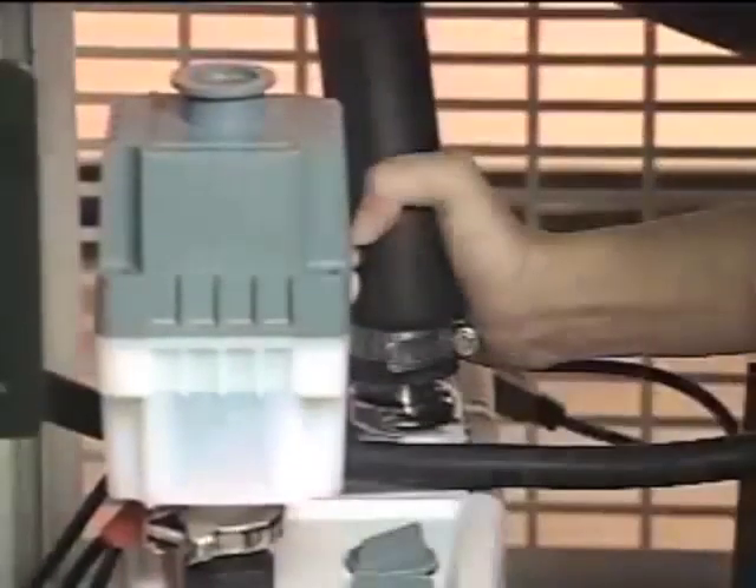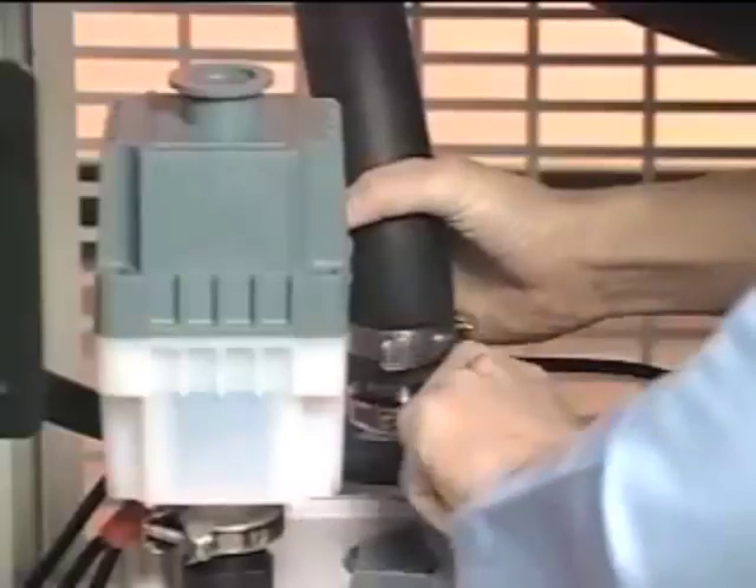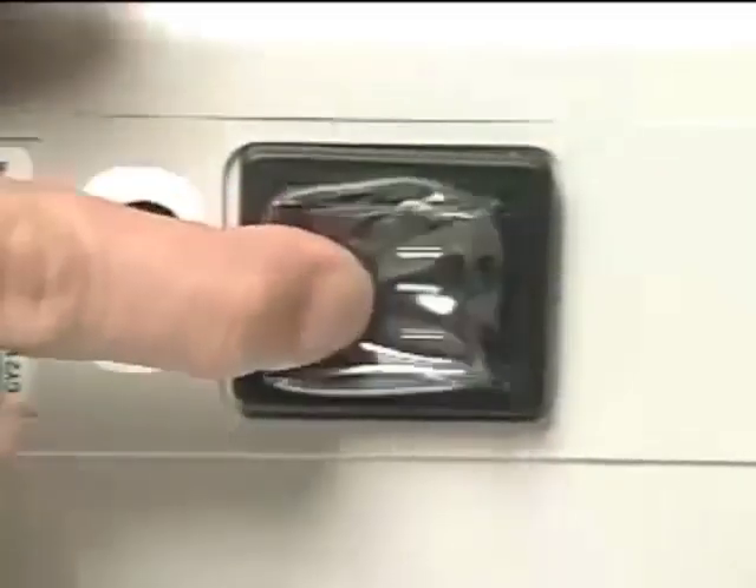Check all connections for a secure fit. The freeze-dryer uses three-quarter inch hose connections. If you've purchased a pump other than LabConco's, verify that it has a three-quarter inch inlet for connection to the freeze-dry system. Be sure the pump is in the off position, connect the pump's power cord directly to the receptacle labeled vacuum pump, and turn it on.